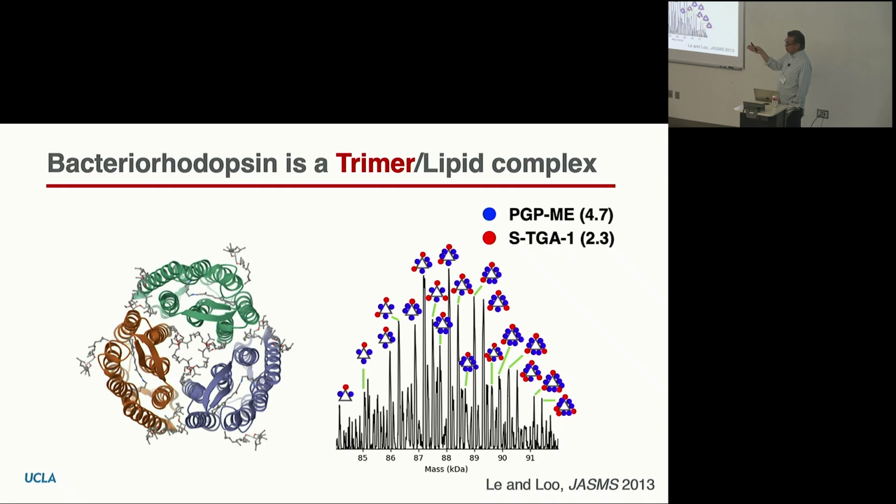You just know the molecular weight, but then you have to do some other experiments. God forbid you do NMR, but you don't want to do that. You know, try to stick with mass spectrometry.